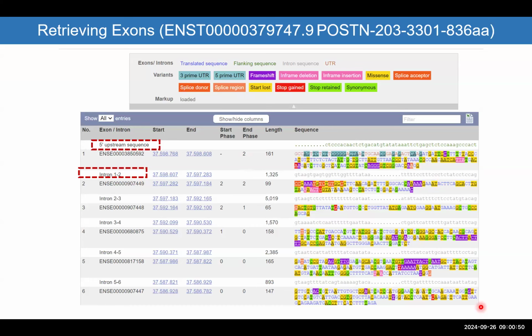There are a lot of SNPs, there are a lot of stops, because there's a lot of variability. I intentionally chose to show you this gene because it shows you many parameters. Like there are splice donors, splice variants, and missense mutations. All that, if it exists, you can easily track down here.